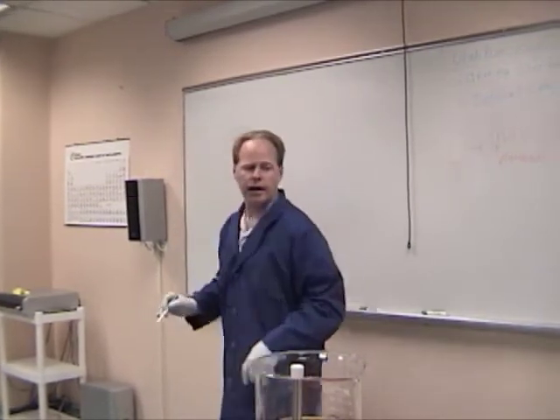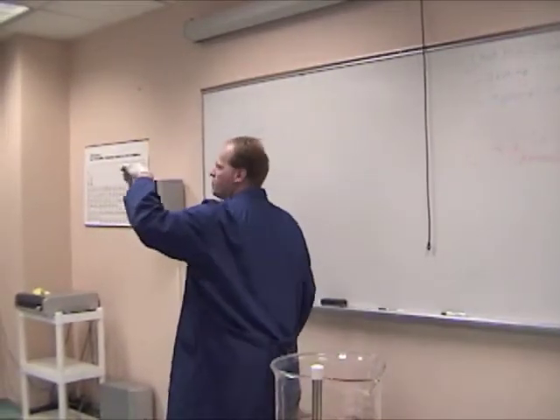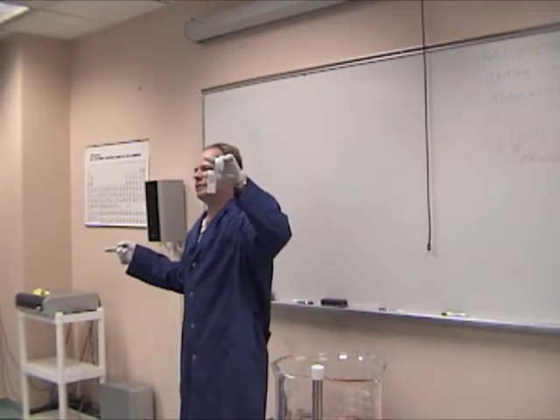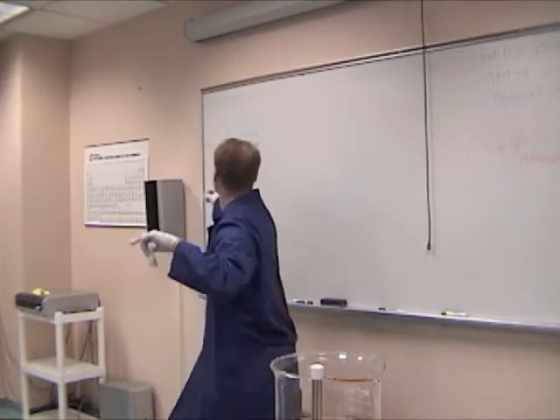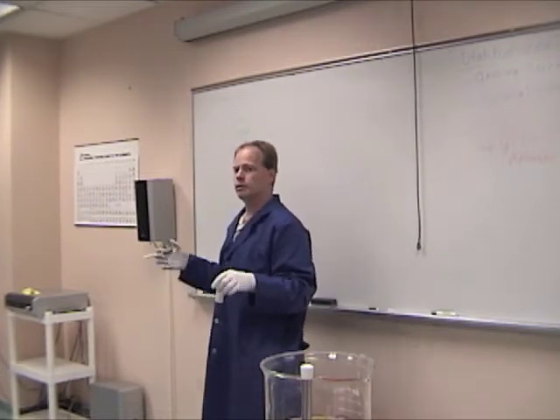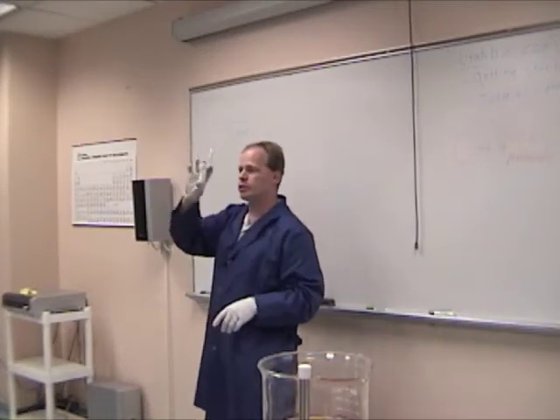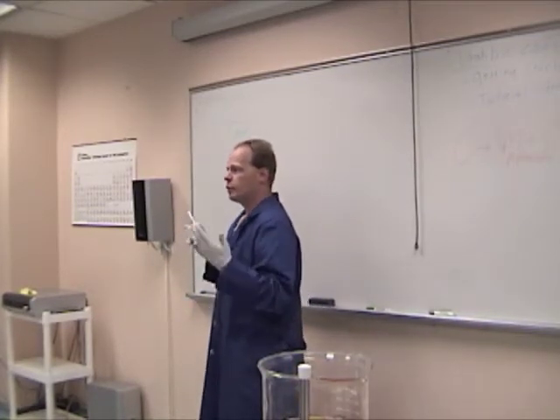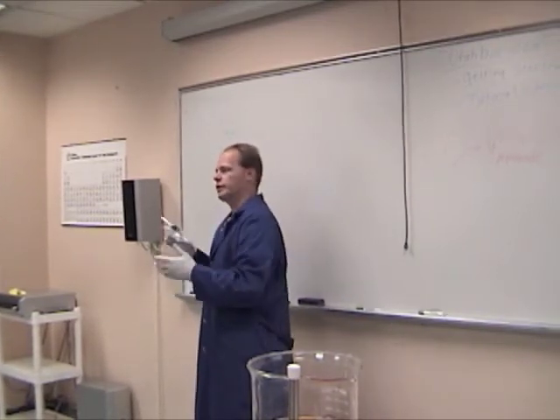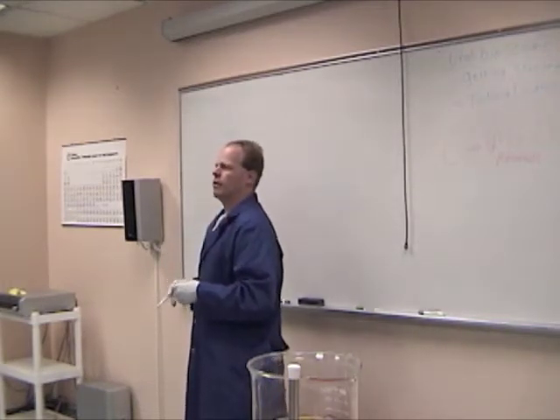Well, I have a really handy base, and I know the purity of it. And I bet if I add base to that acid and I measure how much base I put in until it neutralizes it, I can figure out how much acid's in there. That is all you're doing when you're doing a titration. You are literally just taking some form of an acid in an oil, and measuring in measured amounts of a base that you know, you record it, you watch when it neutralizes it, and then there's a couple formulas that'll tell you how much acid was in that oil. Why do we want to know that?